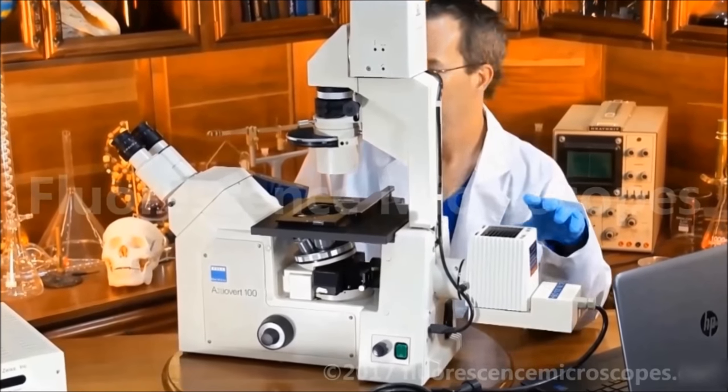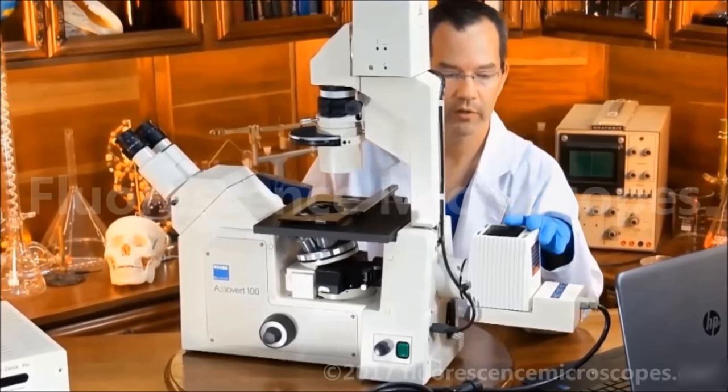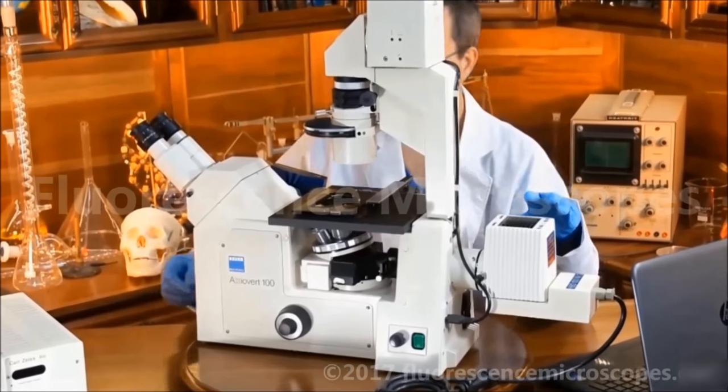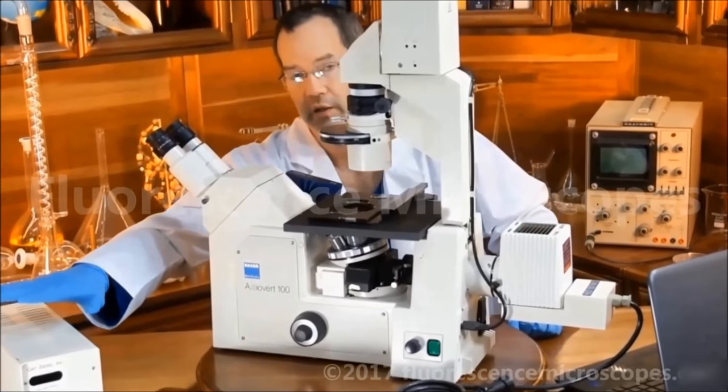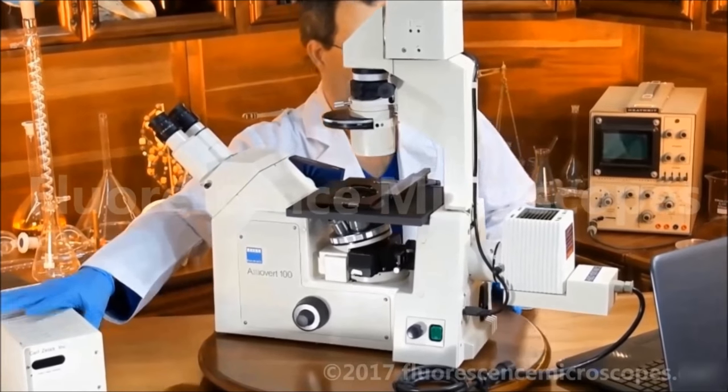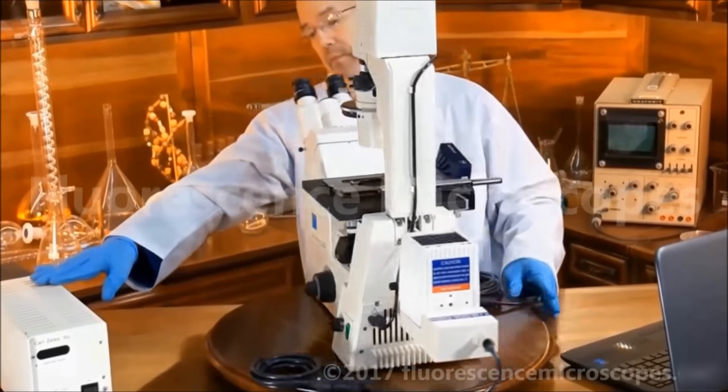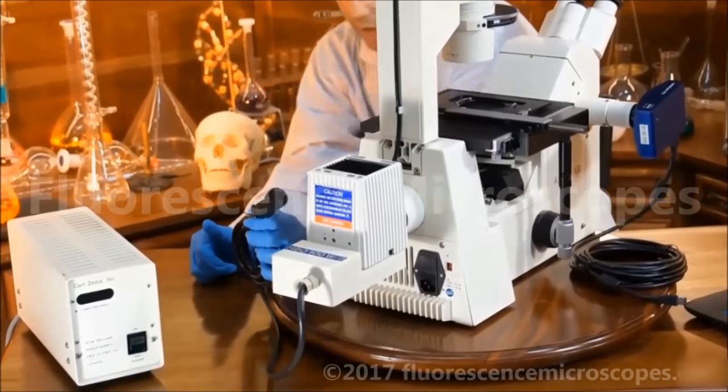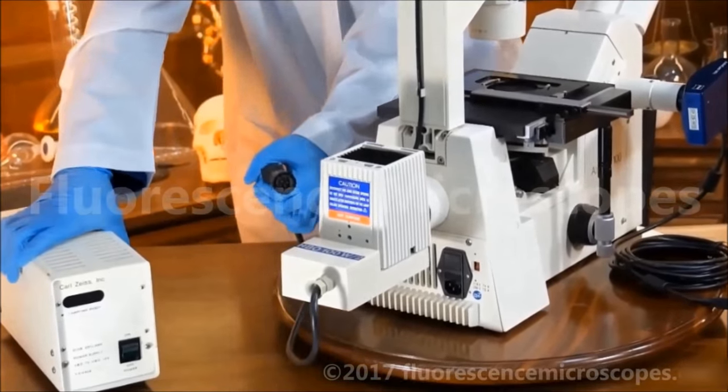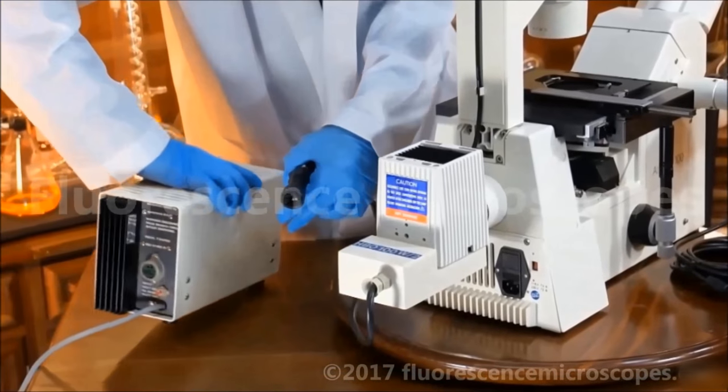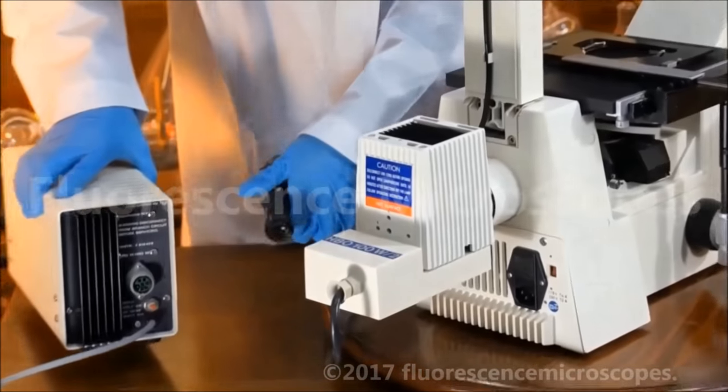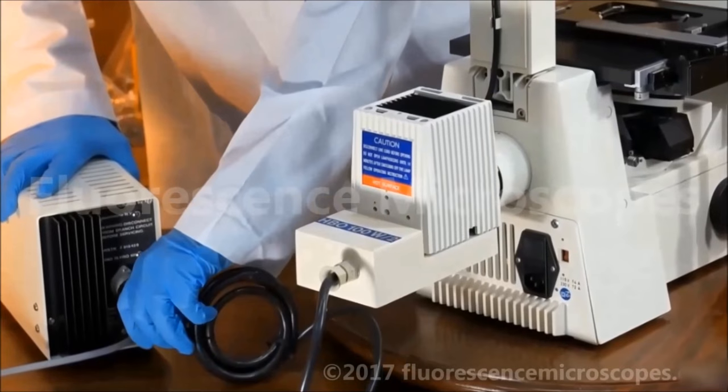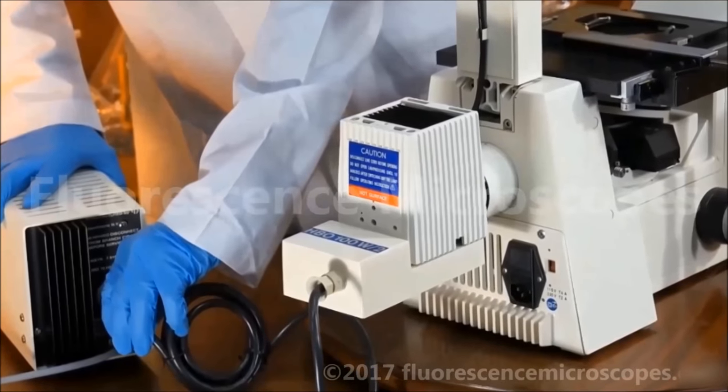Now, the design for the Mercury illuminator, we do have an external power supply, and it's just going to connect up with this cord. Connects right to the back of this power supply.